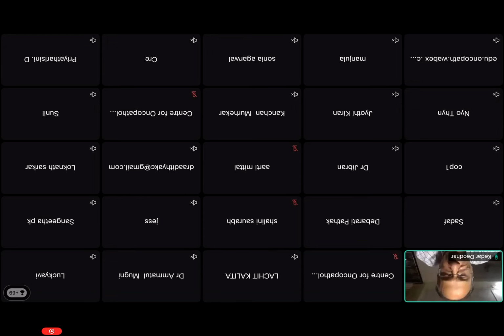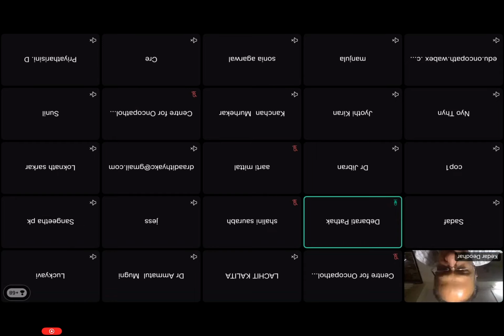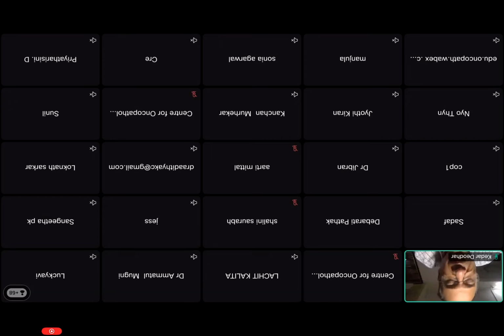Okay, sir. Is there any cutoff of site-specific lymph node yield in GI cancers post-NACT? For colorectal, a minimum of 12 are required. For gallbladder, 6 are required. And for stomach, at least 15 or 16 are required. We understand that post-chemotherapy, the number is going to be low. But our attempt will be to recross and try to get as close to the prescribed number as possible. And we should mention in the report that recrossing is done and extra sections do not yield any additional nodes, or yield 2 small additional reactive nodes, something like that.